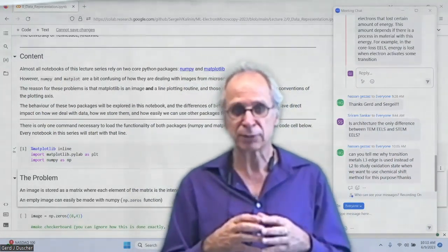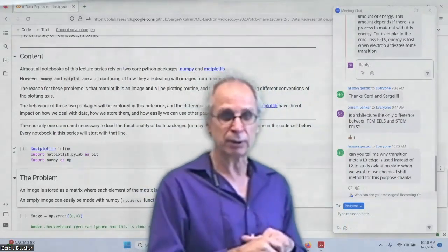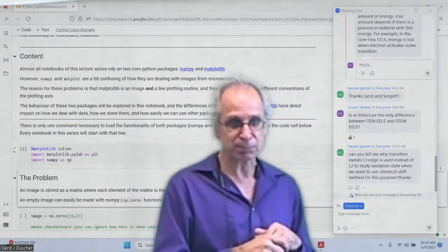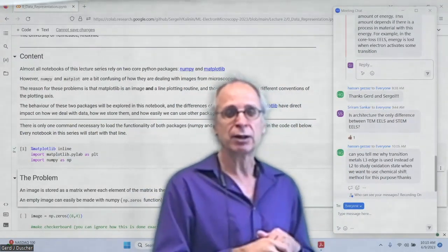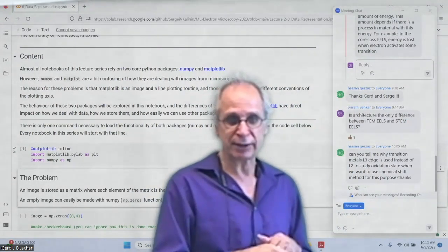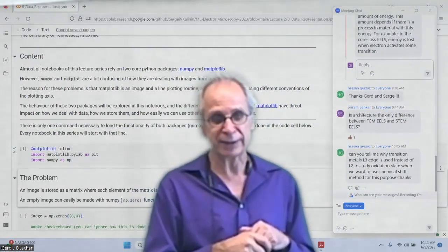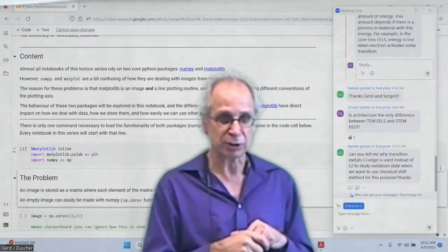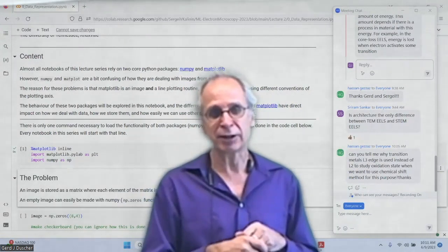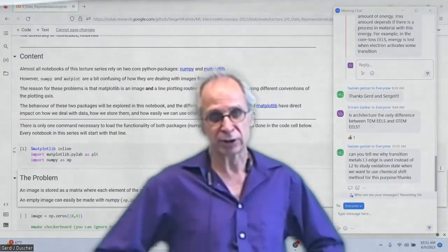If you do it right. If you do it wrong, it's too small, and your results will be crappy. That happens. Sometimes, for one reason or the other, you have to do that. But analysis is then difficult because you don't know exactly what contributes to your signal. So in TEM EELS, it's relatively clear cut because you know what your convergence and collection angle is.